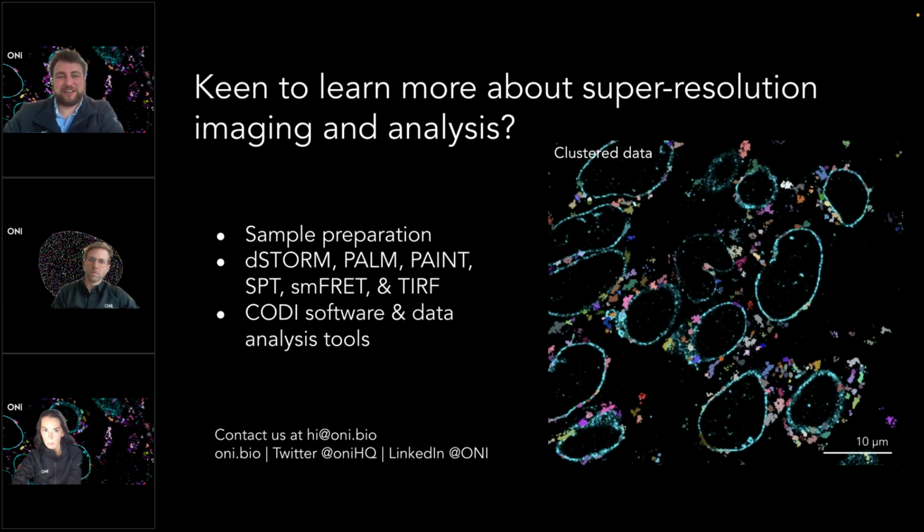But if you do want to play around with those parameters, then hit the big question mark and it will tell you in detail about each parameter, and you can fine tune and optimize them. And then of course, save those parameters and use them across the rest of your analysis. You can save your favorite parameters with the little star button, and then they'll always appear at the top of the list for you to select every time. I hope that answers the question in some detail. Great, thanks. Feel free to reach out to us specifically afterwards if you need some help or have a specific question.